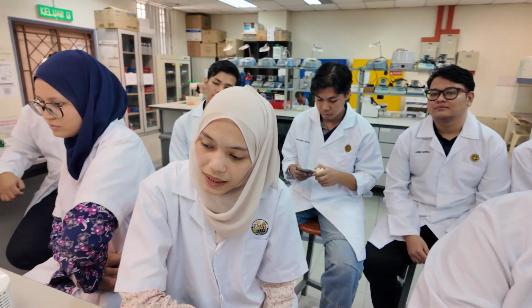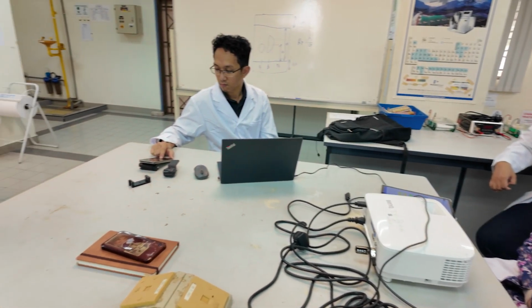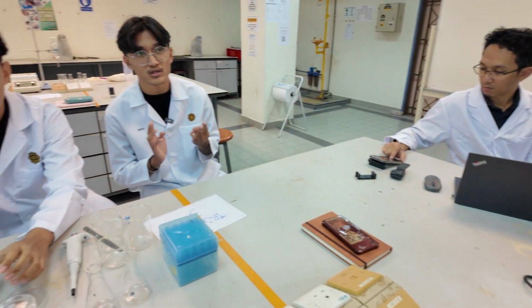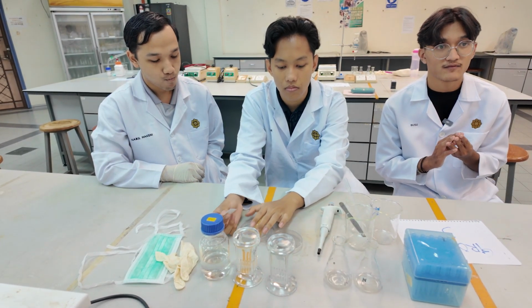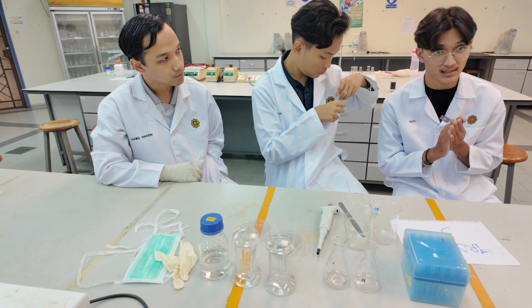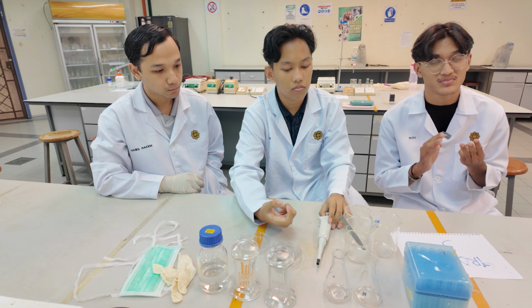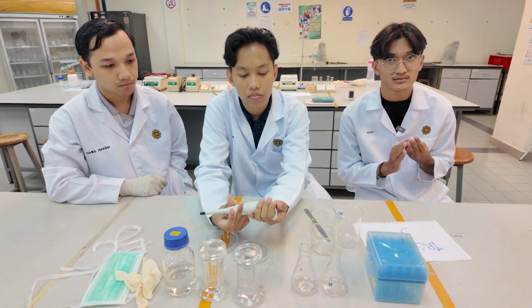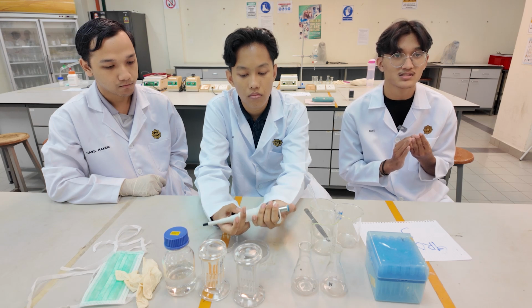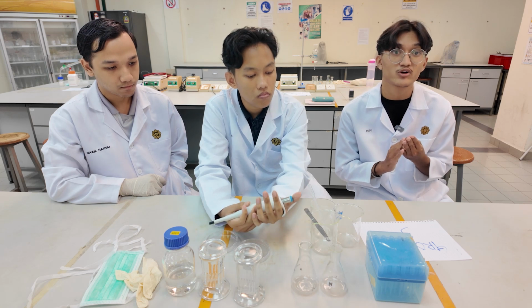Okay. For the pharmaceutical industry, we use TLC to test the purity of the substance. For example, scientists use TLC to test the impurity of raw material and the final product. For example, in the production of painkillers, which is medicine, we use TLC to check whether there are leftover reactants or byproducts that occur during the production.